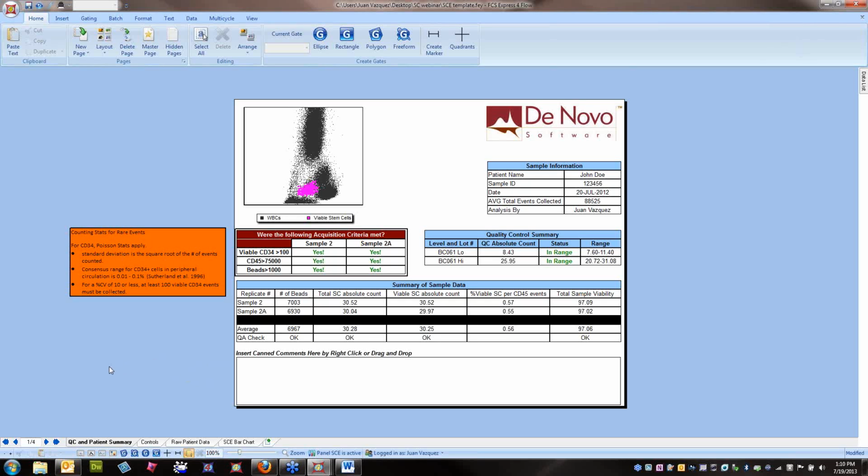In this case, because the first 2 pages were just text, it was basically part of my presentation. Once I loaded the analysis in, I told FCS Express to hide those once I loaded my data into my plots. So now I can focus on the analysis, but I still had those slides for the presentation there prior to presenting the data.